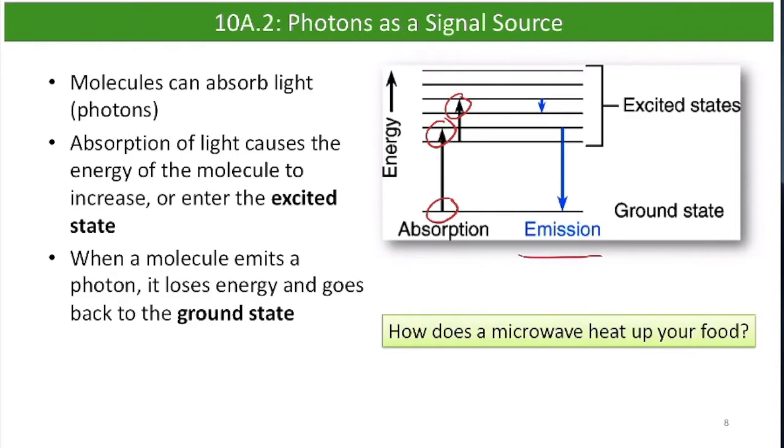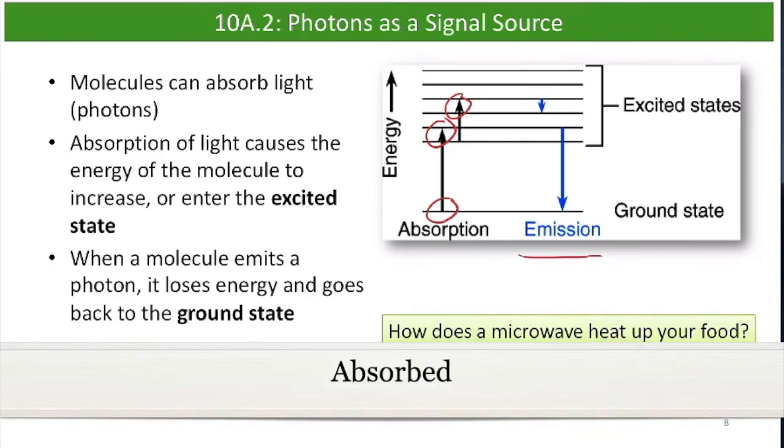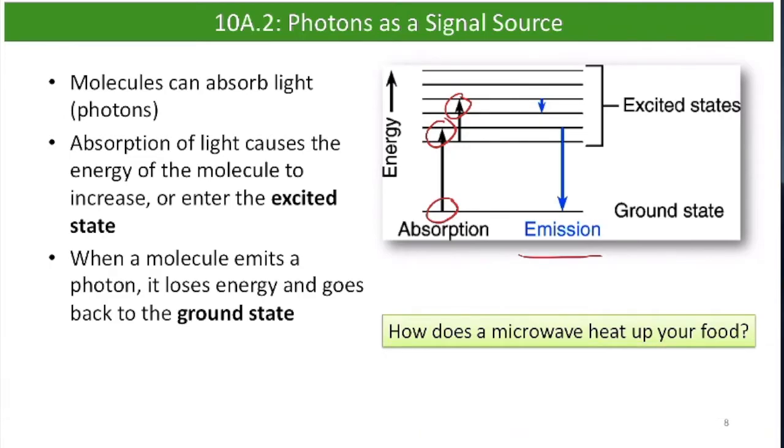So we can either measure absorbance, so how much light disappears, right? So we shine light at a blank sample, all the light would go through, so we wouldn't have any absorbance. We add some analyte to that mixture, and then some of that light is blocked, so we get a reading that would give us an absorbance. And the more of our analyte is in there, the more of that light will be absorbed, and that will give us an indication of how much analyte is in our sample. Or we can measure the emission of our sample.